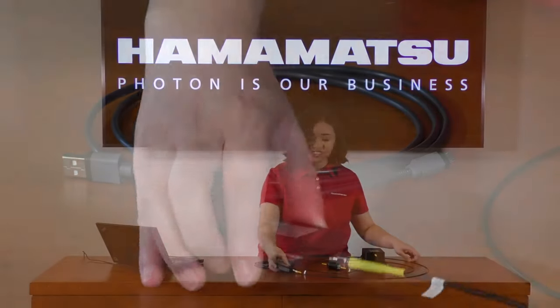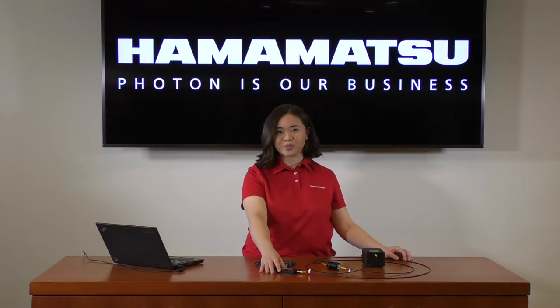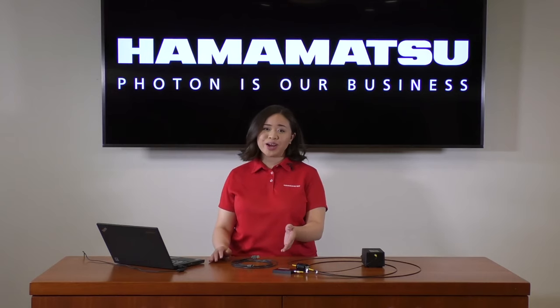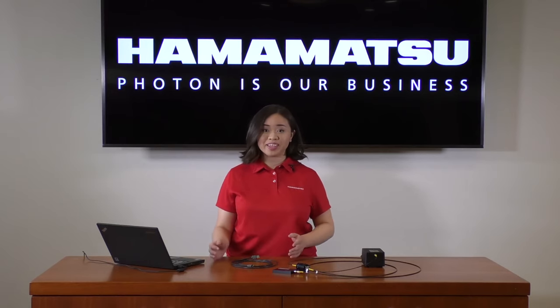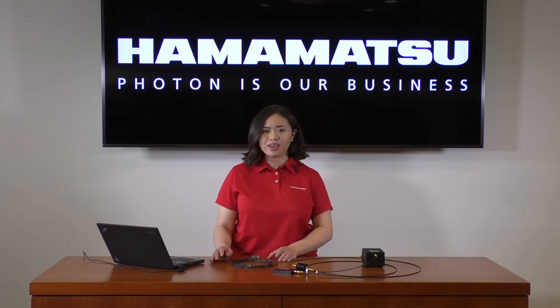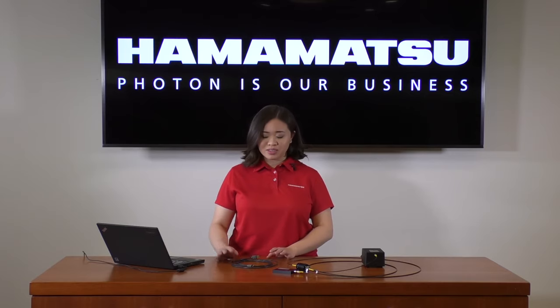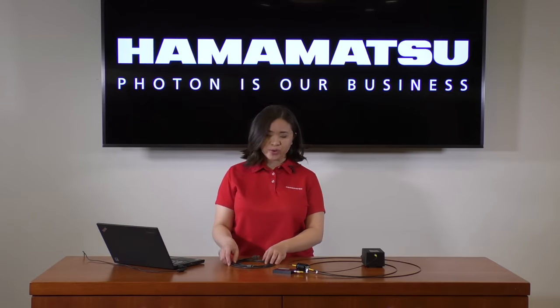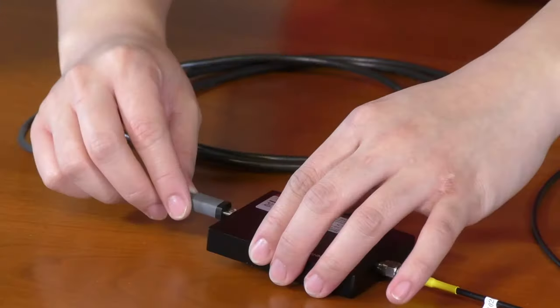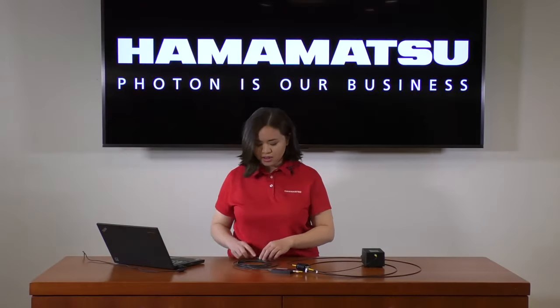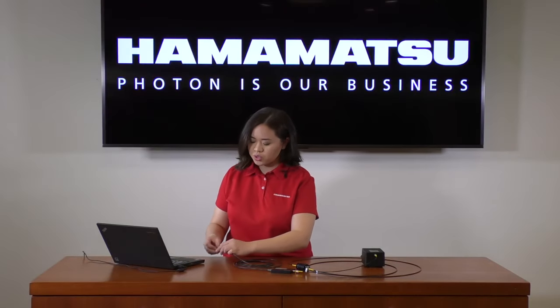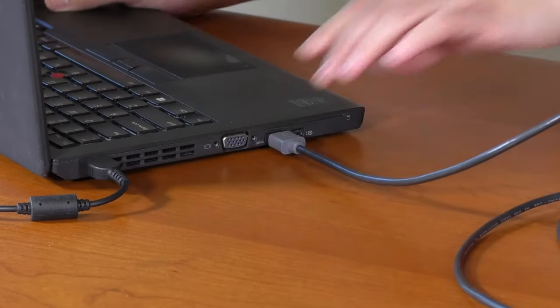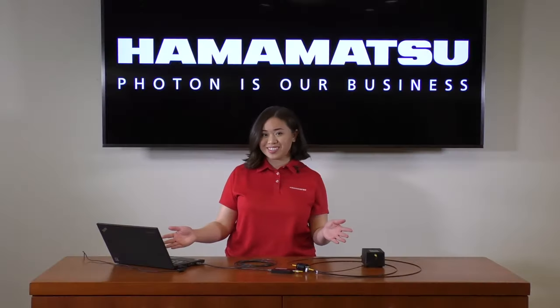And that is it as far as our optical connections go. All this spectrometer requires to be operated is USB bus power, making it ideal for portable implementations where access to a power supply or outlet may not be available. So, taking our USB 2.0 cable, we'll use our micro USB end, connect it to the spectrometer, connect our USB end to our PC, and that is it. We are ready to begin testing.